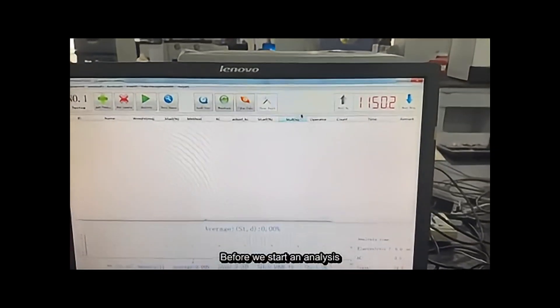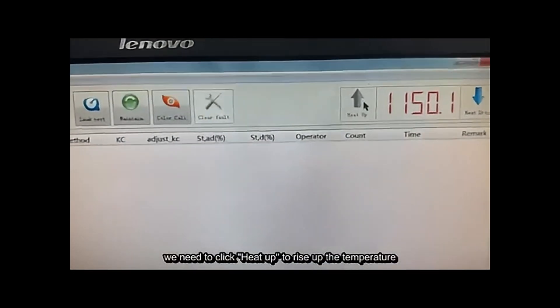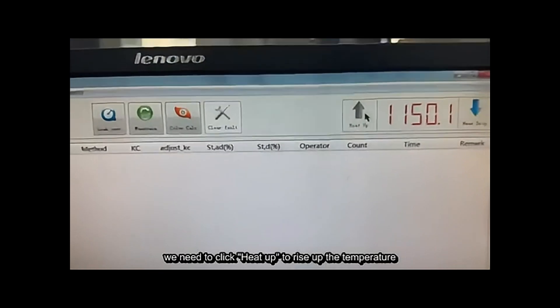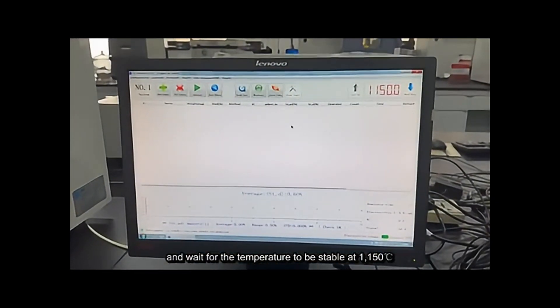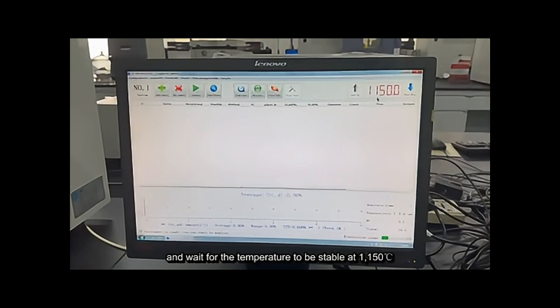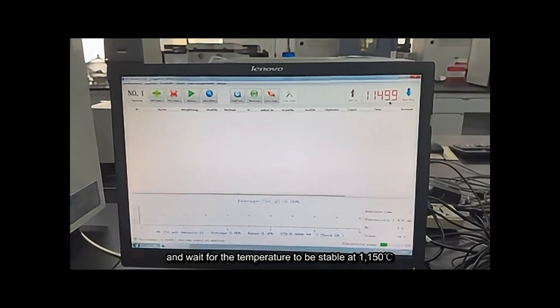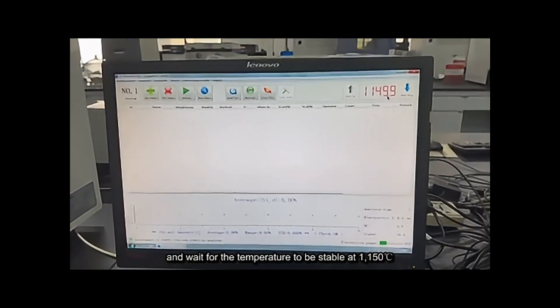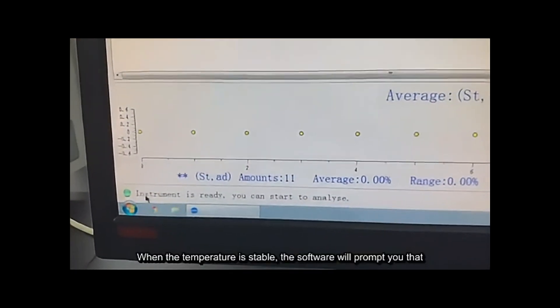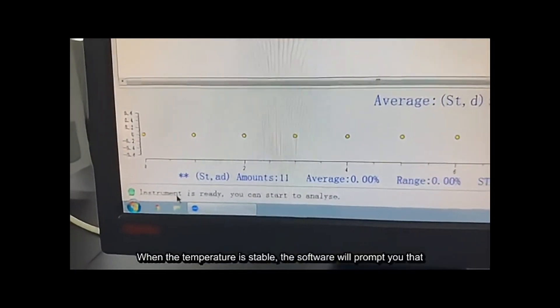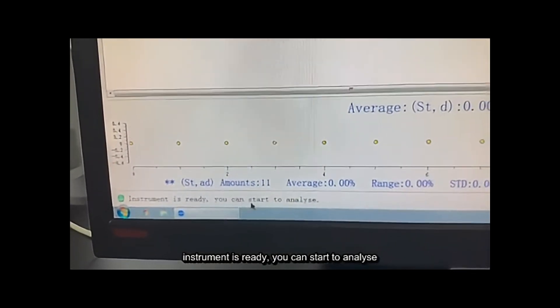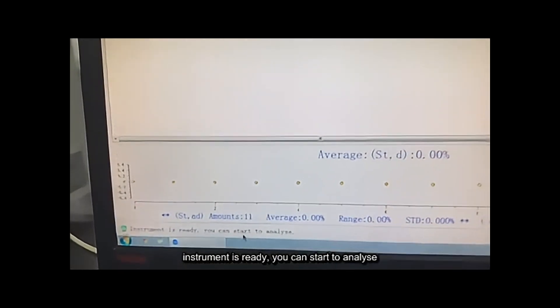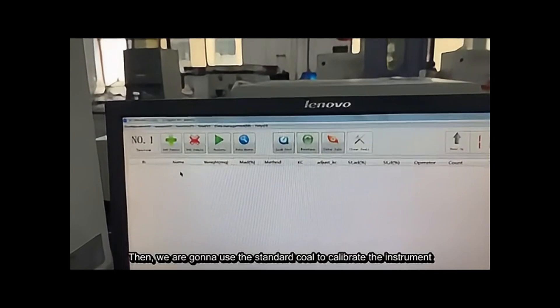Before we start analysis, we need to click Heat Up to raise the temperature, and wait for the temperature to stabilize at 1150 degrees Celsius. When the temperature is stable, the software will prompt you: instrument is ready, you can start to analyze.